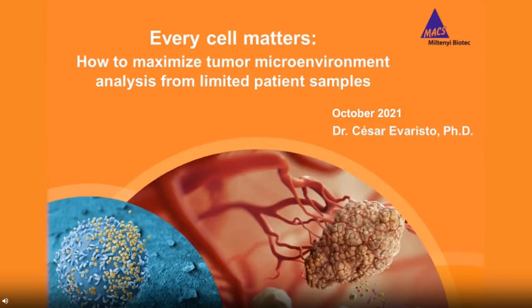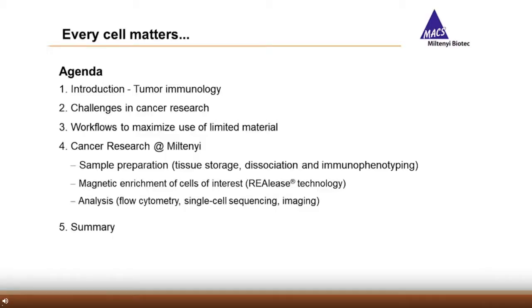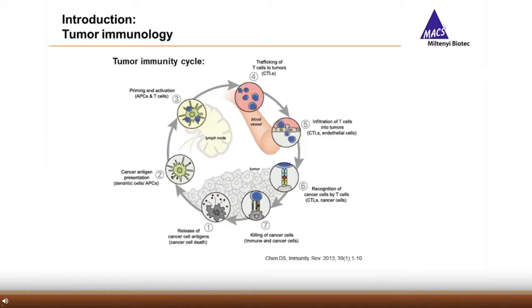Welcome you all to this webinar entitled Every Cell Matters: How to Maximize Tumor Microenvironment Analysis from Limited Patient Samples. I will start by giving a short introduction, followed by identifying some of the challenges faced when conducting cancer research and how we developed workflows to overcome those challenges. I will then zoom in on some of those workflows and detail some of the tools we use for sample preparation, magnetic enrichment, and analysis of the populations of interest.